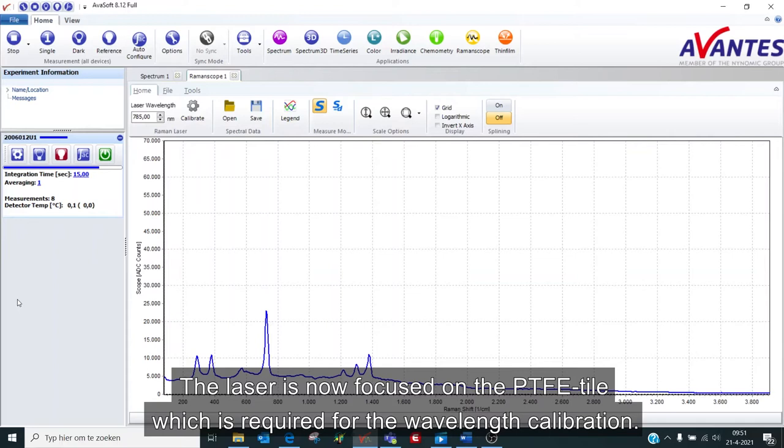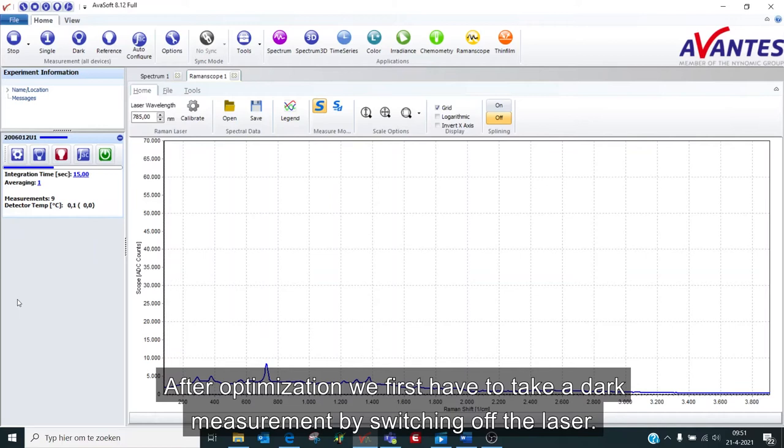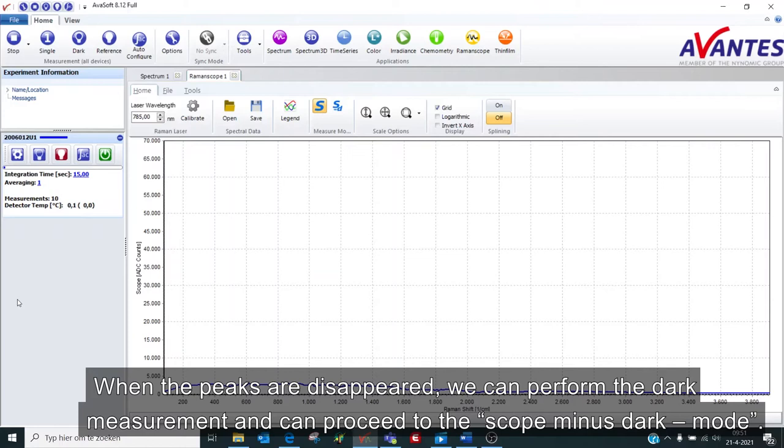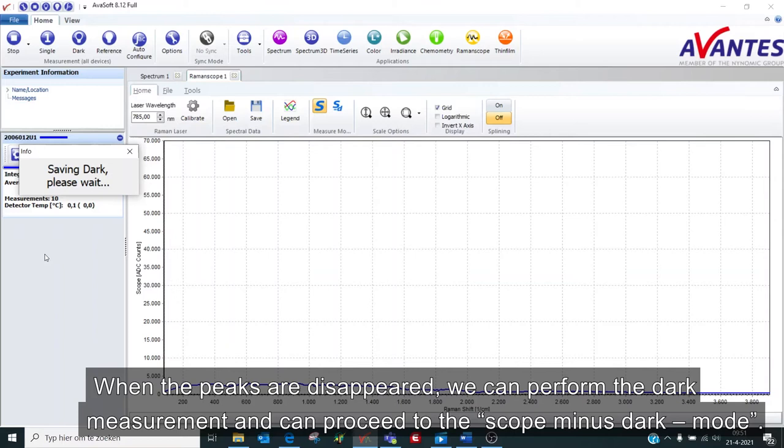After optimization, we first have to take a dark measurement by switching off the laser. When the peaks have disappeared, we can perform the dark measurement and can proceed to the scope minus dark mode.